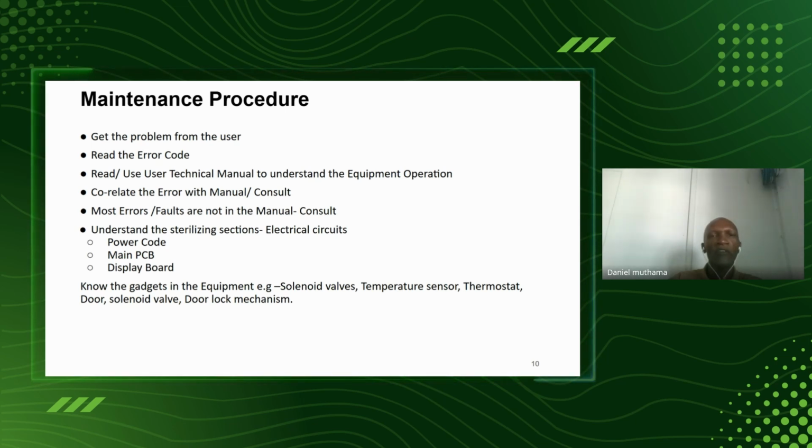If you are not able to understand, most of the errors are not within the manual. We are requiring the engineers to make consultations. Most errors or faults are not in the manual. In that case, you do what? You consult. Understand the sterilization sections.